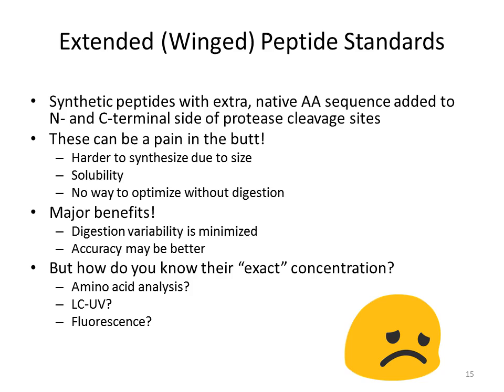So another option is what I mentioned to a couple of people in the room today. There's some people that like to use synthetic peptides that can be synthesized the same way with heavy labeled amino acids, and they have native amino acid additions on either side of the N terminus and C terminus where lysine would normally come in and cleave. And the idea here is that there's something for trypsin to go in and digest when you add your standard. So it's a good idea because you have to add them pre-digestion, but they're kind of a pain to work with. So has anybody worked with these before?